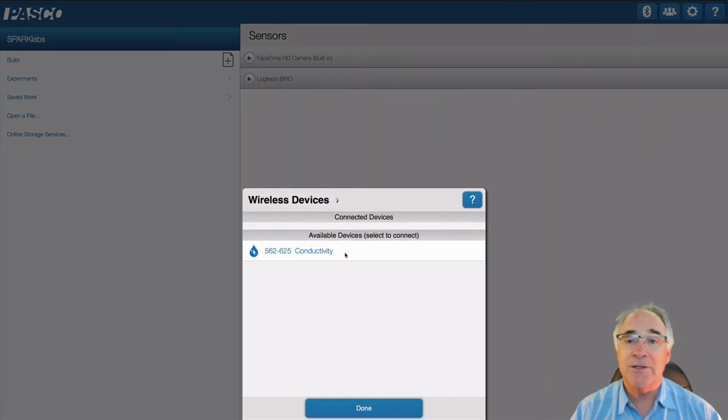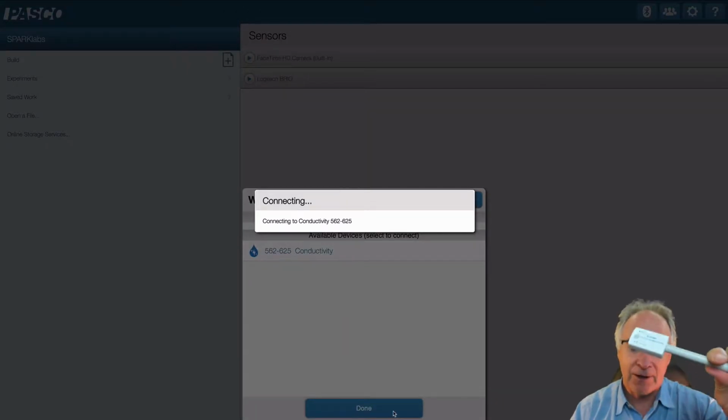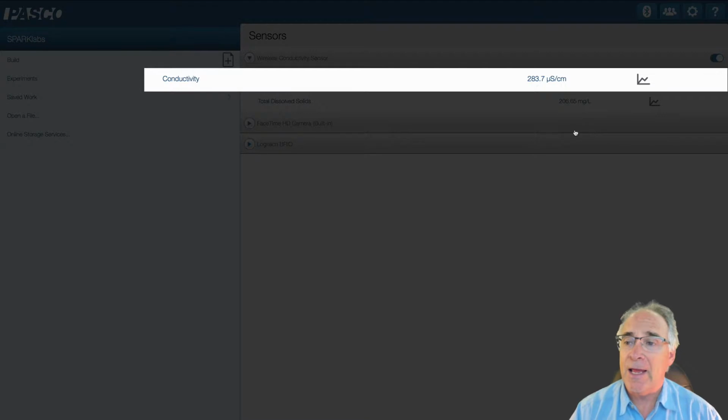And then in the wireless devices page, you're going to see conductivity. That's the number I have right here. So I'm going to click done. And you can see it's beginning to read. That tells me it's working. So we're going to do the next one.